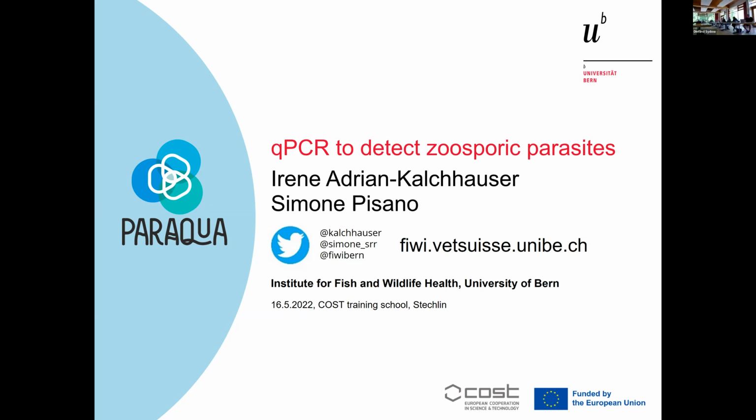Okay, so to kindly introduce all the steps that can be done to work on zoosporic parasites and mention qPCR as one of them. And that's usually a good choice when you know what you're looking for.